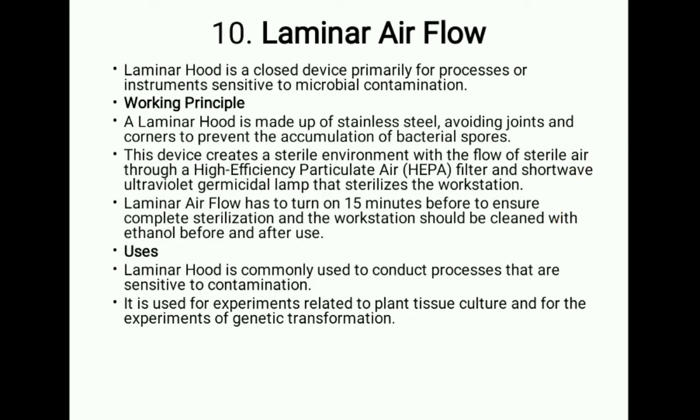Next we have laminar air flow or laminar hood. A laminar hood is a closed device primarily for processes or instruments sensitive to microbial contamination. Talking about the working principle, a laminar hood is made up of stainless steel, avoiding joints and corners to prevent the accumulation of bacterial spores.